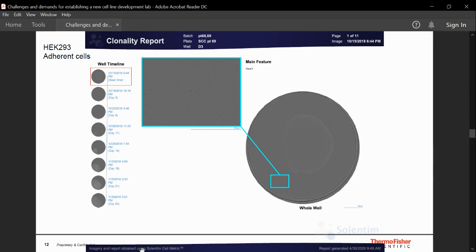It's incredibly powerful. You can see in the expanded image of the bottom left of the well that there is one single cell in that well. Then when we image a few days later, you can see multiple cells. And then as we move forward through time, again, you see more and more cells pretty clearly from the small image and from the enhanced image. It's really quite powerful, and there's a lot to see.